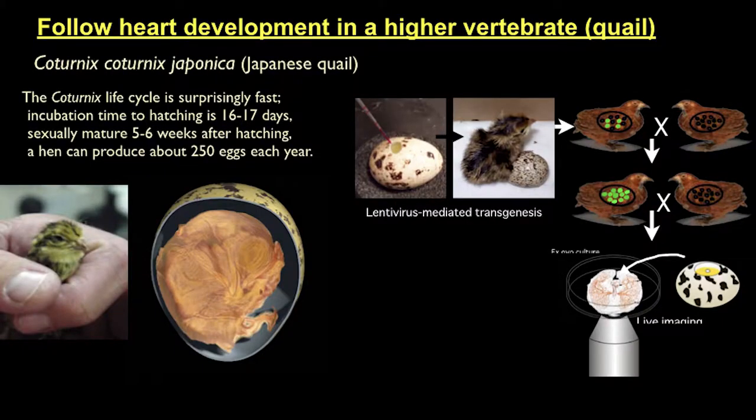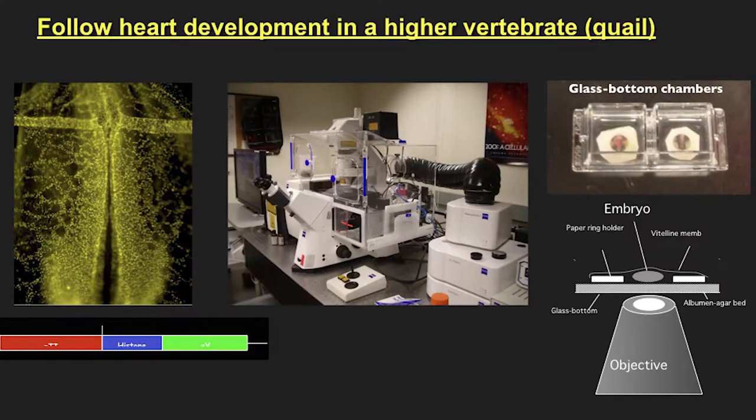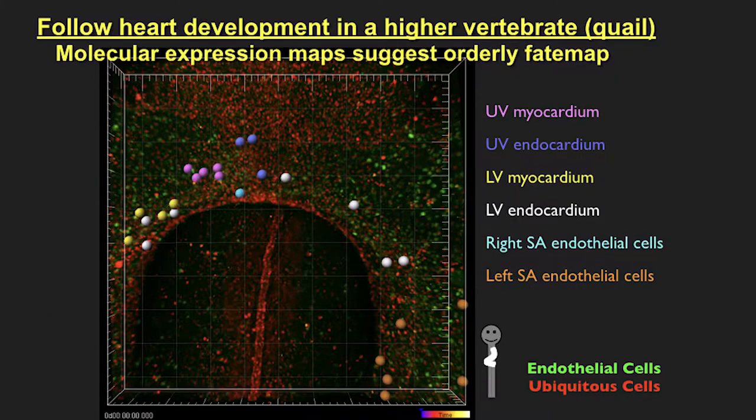So what we've been doing is deploying in both mammalian systems and other higher vertebrate systems like transgenic quail, being able to make transgenic quail by, in this case, using lentiviruses, deploying them because they're such a convenient imaging system. We can take the embryos and put them out in a culture chamber, put them on a microscope, and since we have tissue-specific reporter genes, we can now follow it over time. And now we can ask just how accurate that map of gene expression that should tell us what the cell behaviors were. So I've just labeled a few of the different cell populations here.